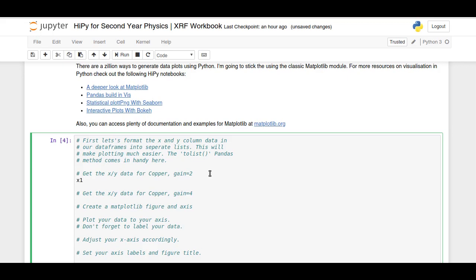So this is going to be a list. Call that variable there, and I'm going to use an np.array. So I'm calling NumPy, and I'm telling it that whatever's coming next is going to be an array or a list of data. Open brackets. I'm going to call my pandas data frame, copper_1. I'm going to specify the first column in that data frame, which is column 0, so all the X data, and I'm going to use the .tolist function. toList, open bracket, close bracket. And then to complete, I'm going to close that last bracket there.